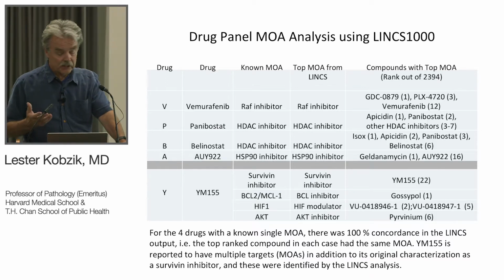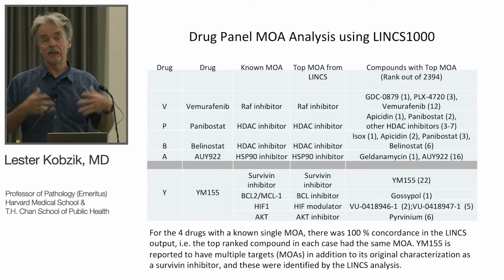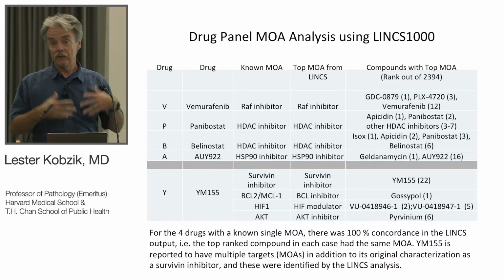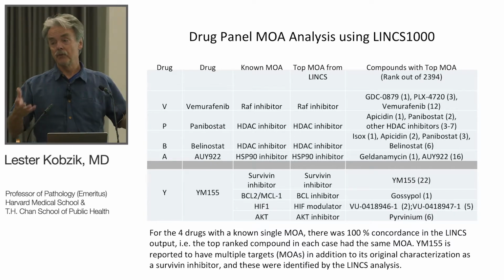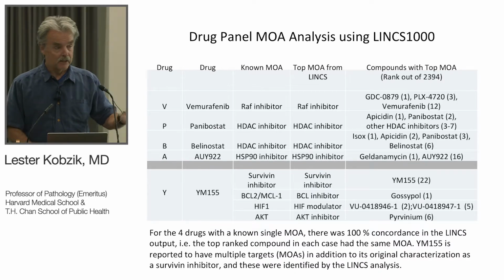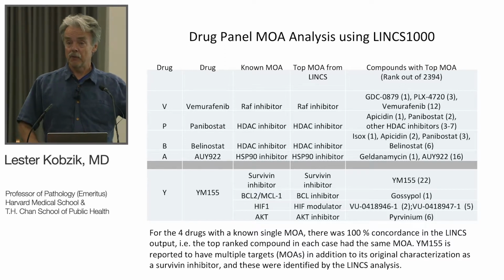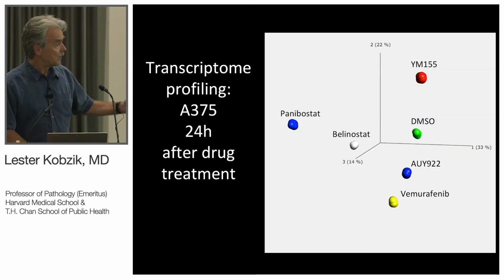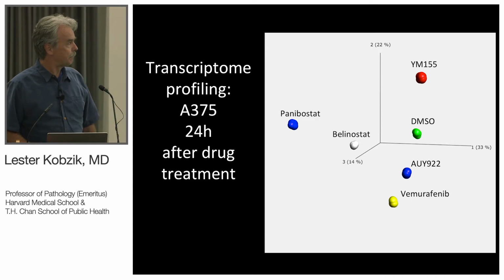So the conclusion from this was that if you show up with a list of unknown compounds, or compounds you have really no idea about the mechanism of action, this is encouraging that you could, at least as a proof of principle, take this approach and at least get a clue to then pursue further action about verifying that this is what you're working with. And this all derived from a relatively easy to perform 96-well plate using the DriverMap transcriptome assay that we're talking about. And here they are with their identities revealed in that original PCA.